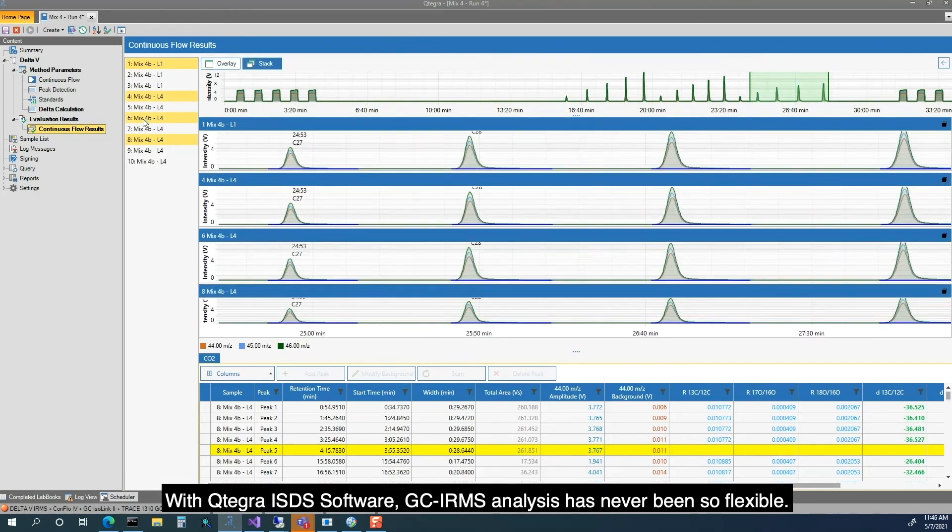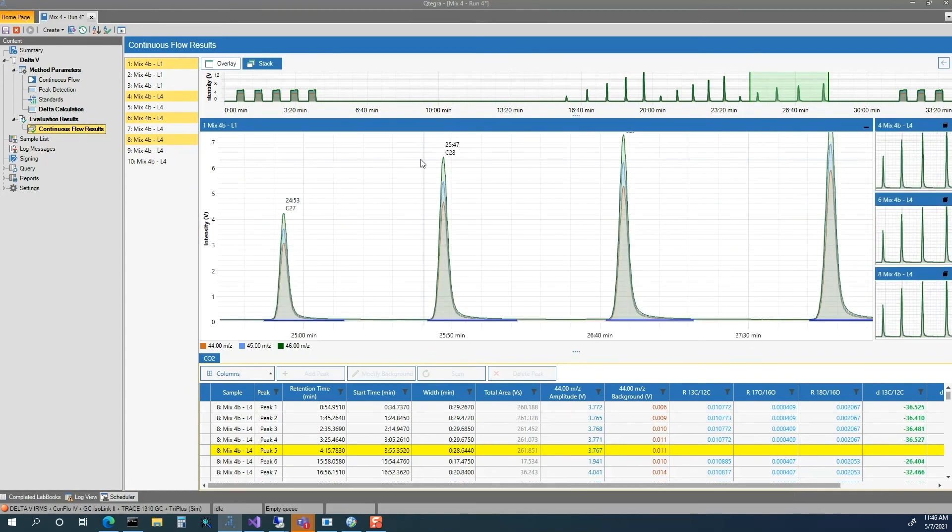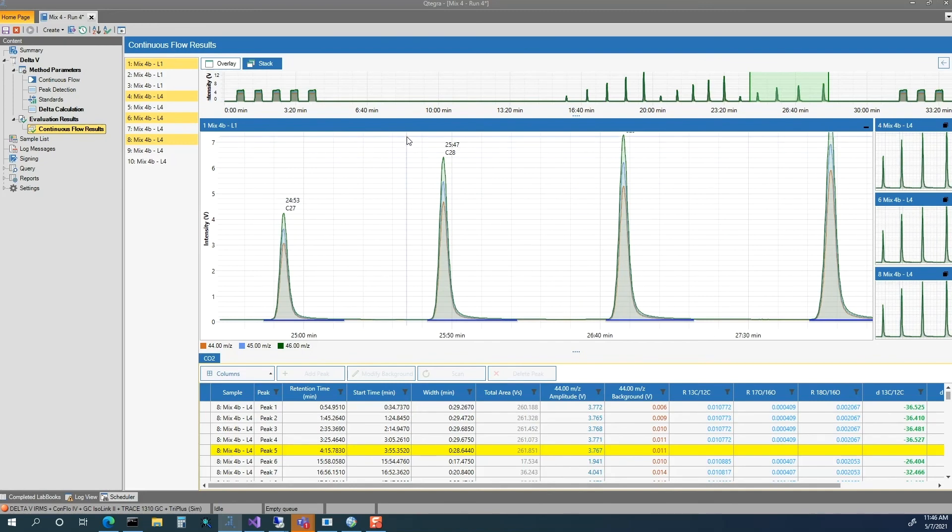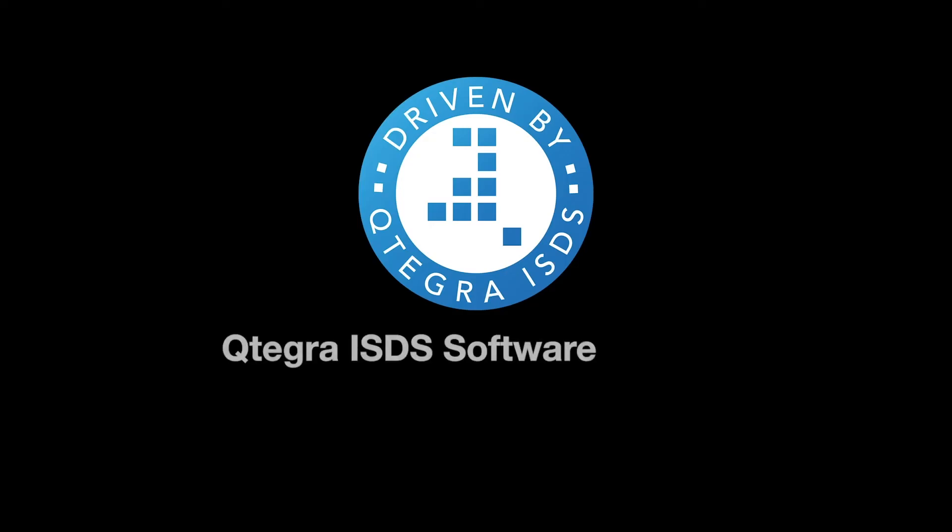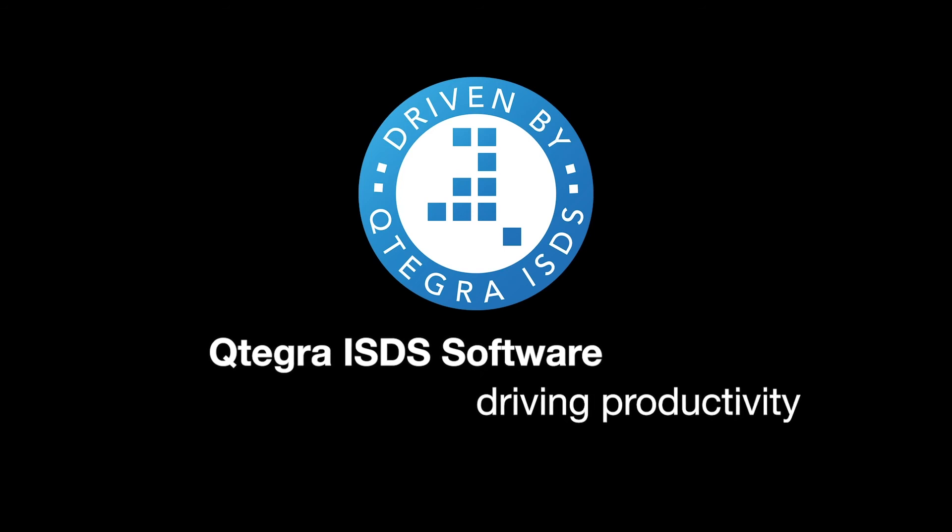With Qtegra ISDS Software, GC IRMS analysis has never been so flexible. Qtegra ISDS Software – Driving Productivity.